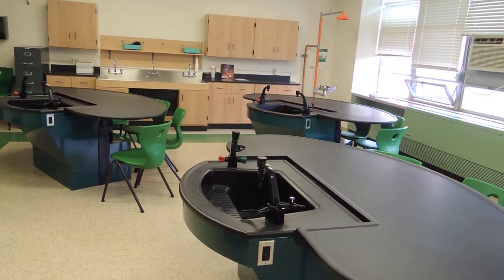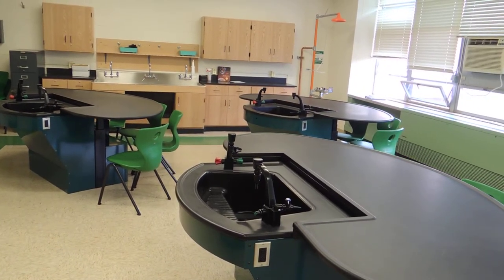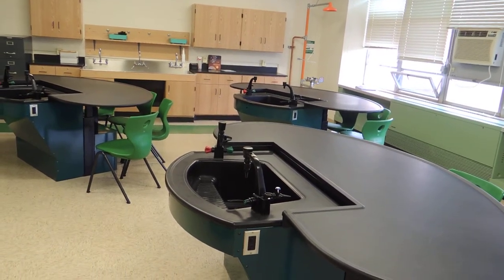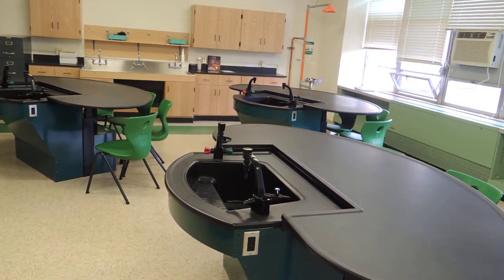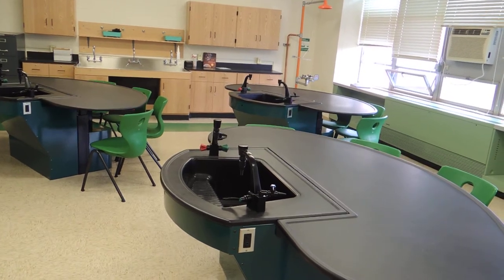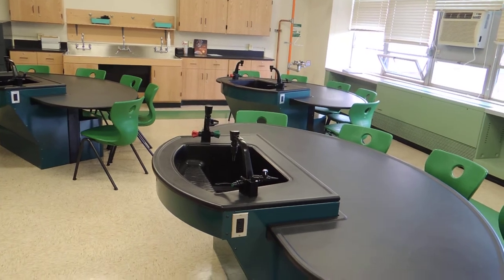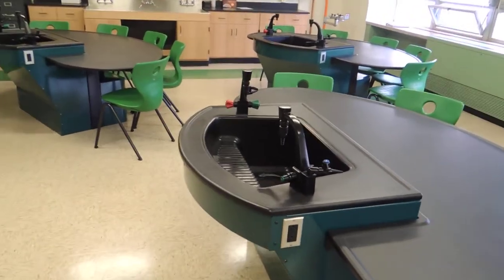From sit-down lecture position to stand-up lab position, these are eight-foot access tables with molded epoxy resin tops and sink.